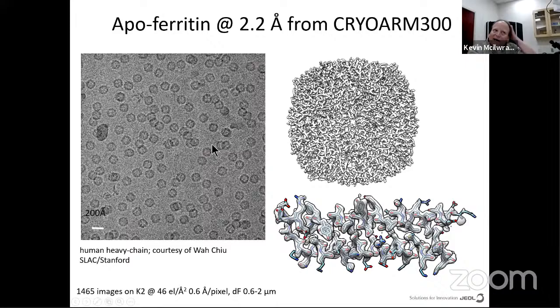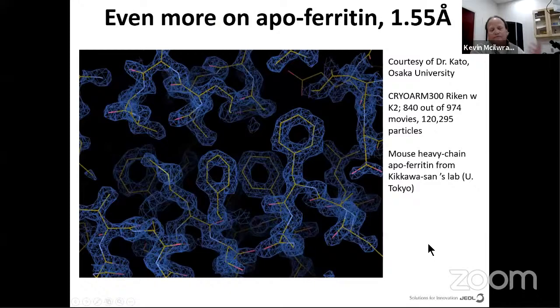In cryo, another way of doing tomography, it's not really tilt tomography, but they're doing single particle. They're imaging thousands of these particles, tens of thousands, and then software can match these particles and reconstruct a 3D volume. These guys are amazing because they're getting down to the atomic resolution level. It's unbelievable what they're doing right now. And this application was the first one to image the coronavirus.